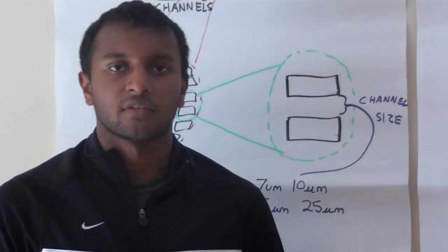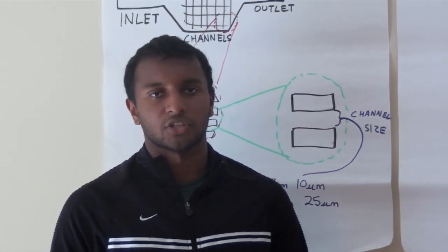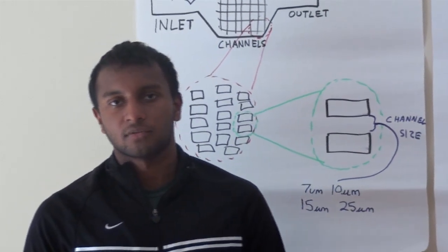After making the devices, I had to create a constant pressure gradient that would drive the droplets through the channels. I used a gravity-driven flow setup.